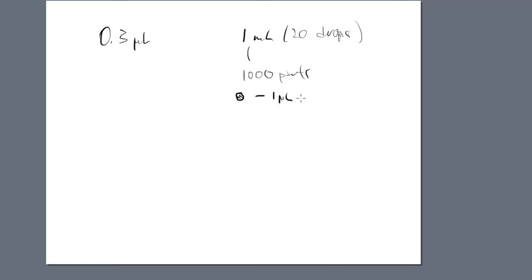Very often in a biology class, a biotechnology course, or whatever the case is, they will introduce you to micropipetters. And a lot of times the micropipetters are 100 microliters to 1,000 microliters, meaning 0.1 mil to 1 milliliter. However, there are times that we need to go smaller.